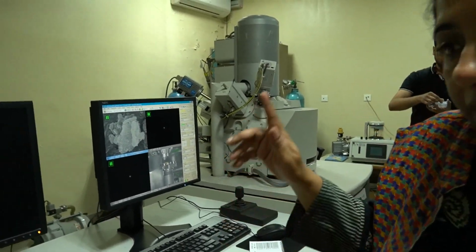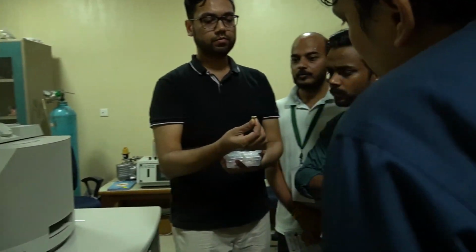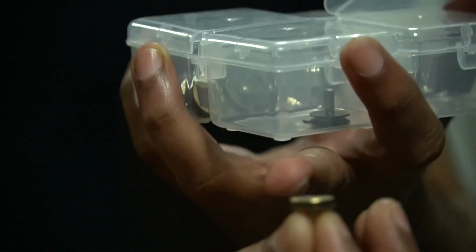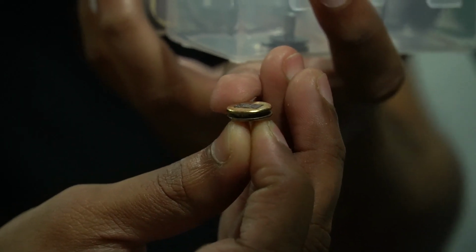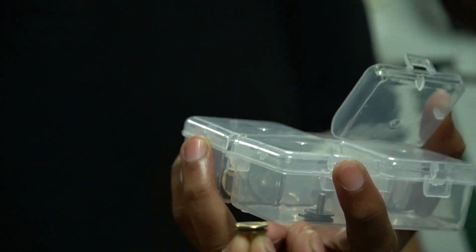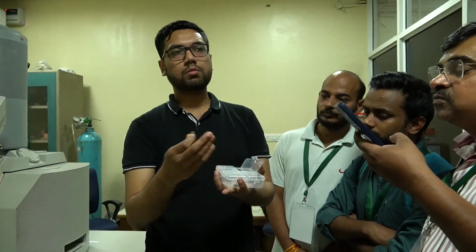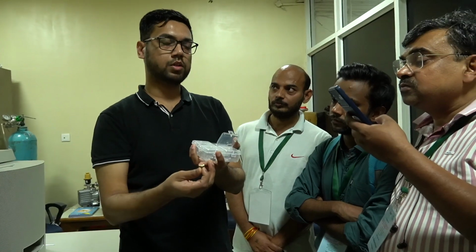In order to analyze the samples, we have a special kind of small specimen holder. It is called a stub. The sample is deposited on it. Here you can see the black thing is called carbon tape. Because the electron is a charged particle, we have to provide it a conductive path. Carbon is almost a conducting layer, and over that the sample is deposited.